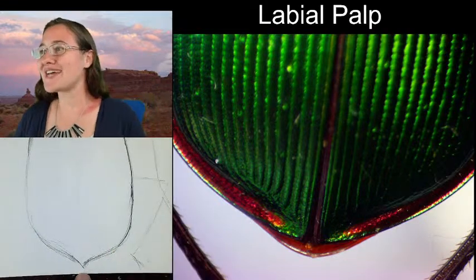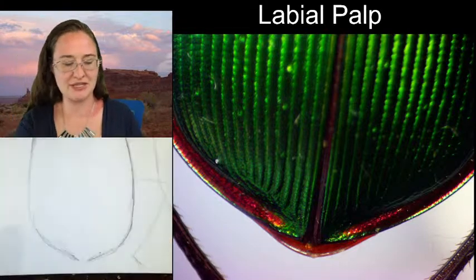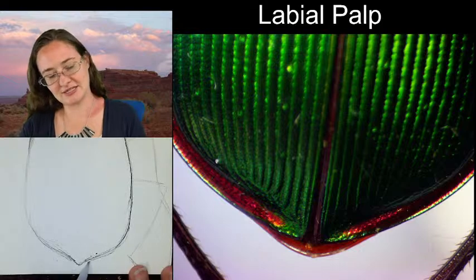Alright, so it does look like we're coming down to a point, but we're probably not coming down to as sharp of a point as I had created. More something like this.